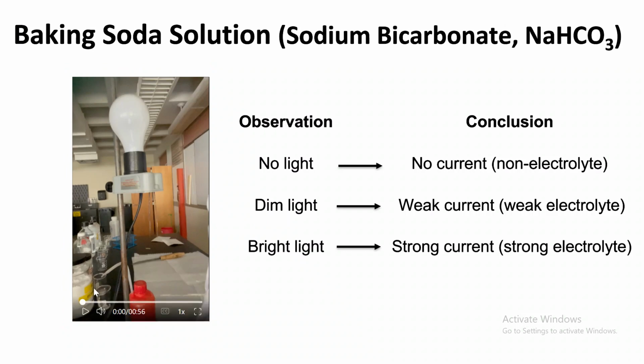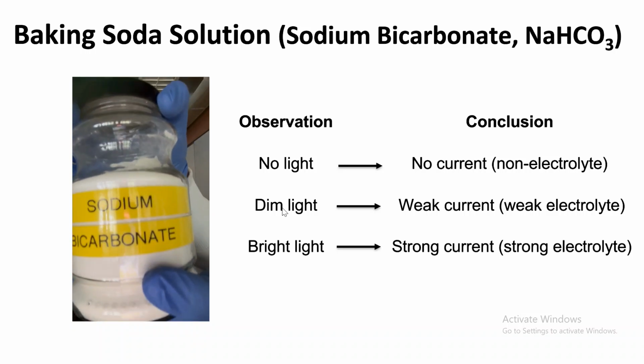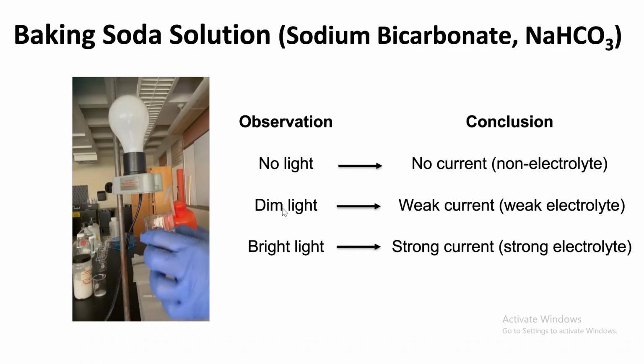That was table salt. Next one is baking soda, which is sodium bicarbonate. As you can see in the video, we have a small amount. Now the sodium bicarbonate is a solid. Does it conduct electricity? The answer is not as a solid. It does not conduct as a solid. So let's try to dissolve it and see if anything special happens.